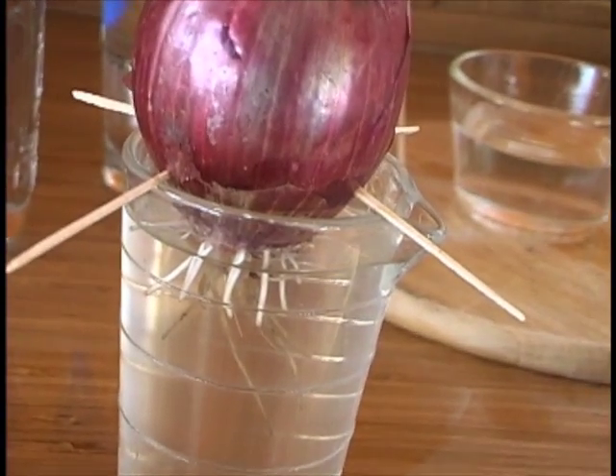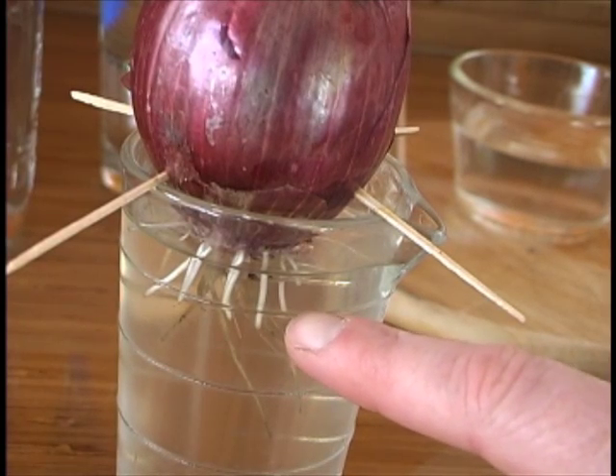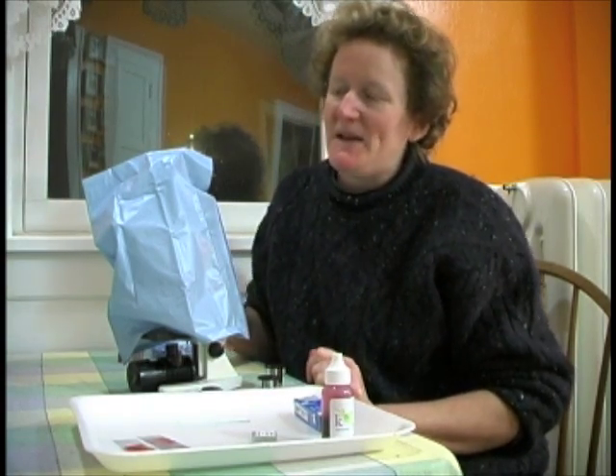Remember, it's the white new roots that you'll want to use for the mitosis lab. Now I'm ready to do the observing mitosis lab.